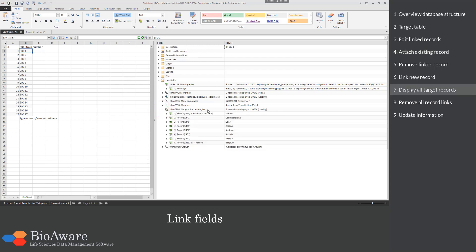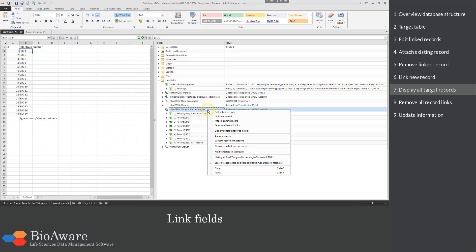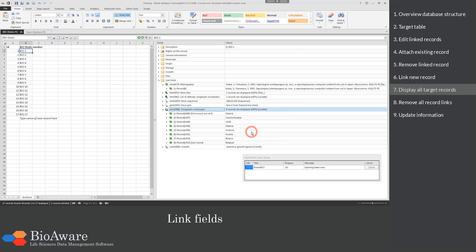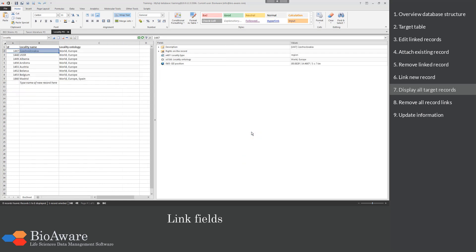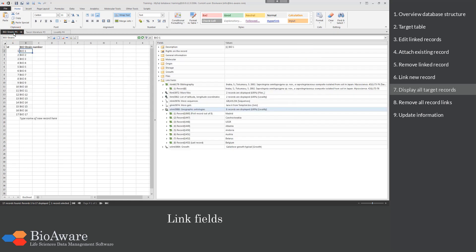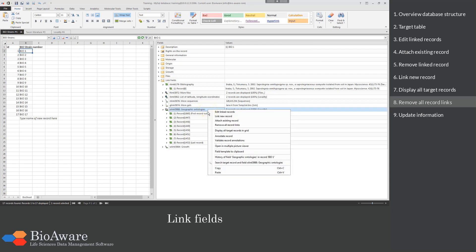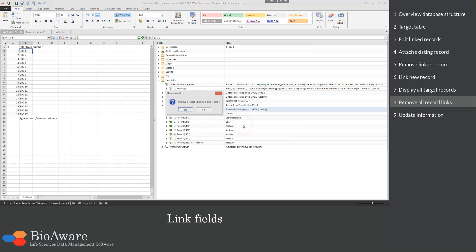To see all the linked records in a separate table view, right-click and choose Display all target records in Grid. The new table view is now open, showing only the 8 records that were linked to the strain Bio 1. To remove all the links of a given link field, right-click and select Remove all record links, then confirm the removal.